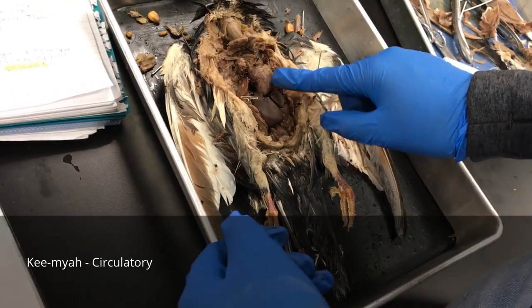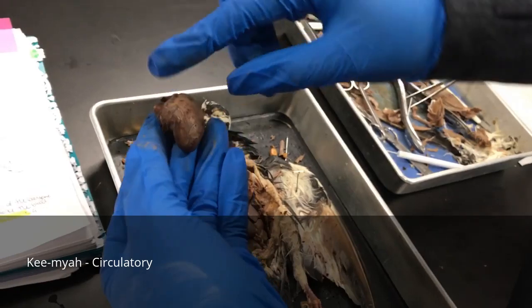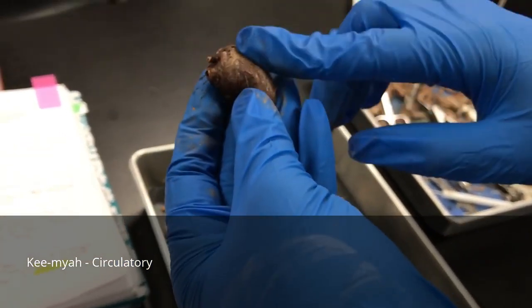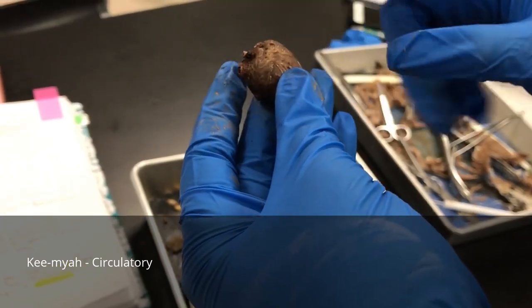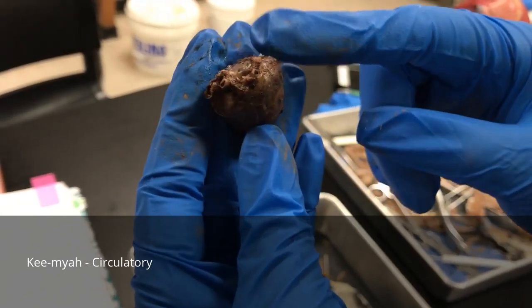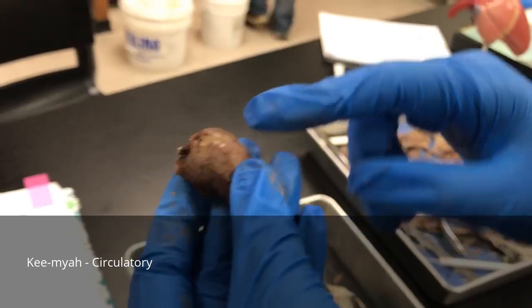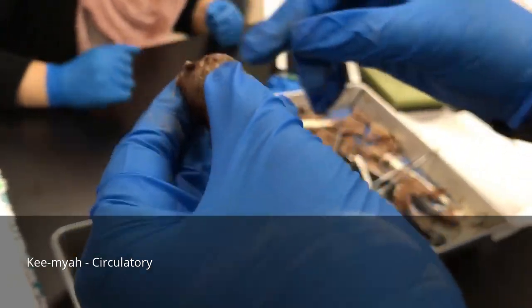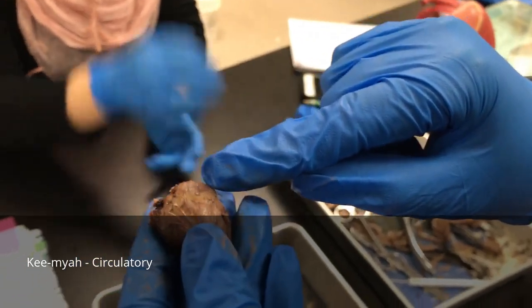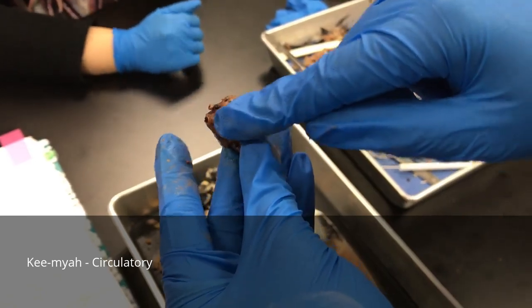Okay, so this is the heart in the body cavity here. And from a ventral view, you can see that the subclavian veins would be here on the right side. The veins are always on the right side here. And I guess you can see, but here on this top section, this is the left auricle, and this is the right auricle here.